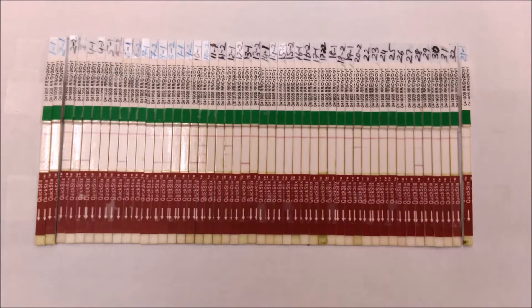The strips are then removed and placed on a white background to view the results. This is an image showing the testing done for a crossing block. There is a control line which appears in all strips. Any mark that appears below this line is an indicator for a transgene. This is what a strip would look like if it contained one of the transgenes being tested, and this is what it looks like for three.